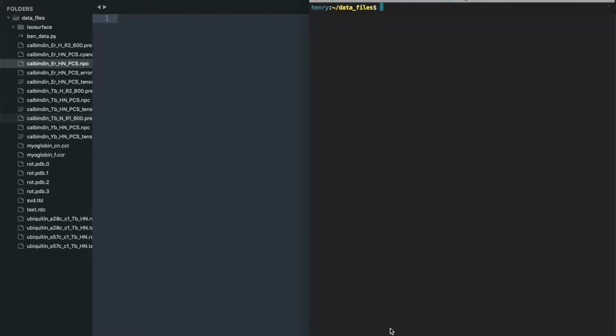I will be demonstrating the graphic user interface for the software, Paramagpy. To begin, we will check that we have Paramagpy installed with pip. If you have previously installed Paramagpy, you can include the upgrade flag.